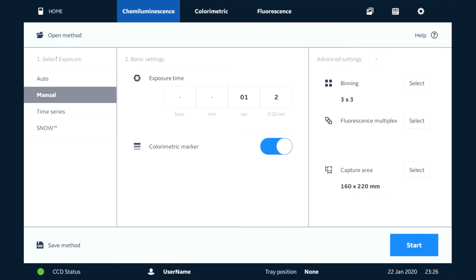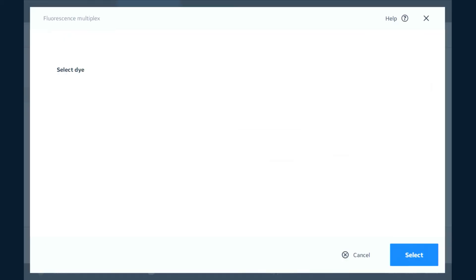We also have the ability to fluorescently multiplex. If you're doing a chemiluminescent blot you might want to do total protein normalization, so you'd be able to use something like Quickstain which would be a Cy5 labeled dye which you can add on to the total protein. So we'll select that here and go to select our dye.